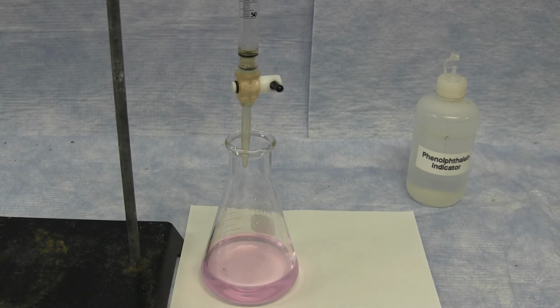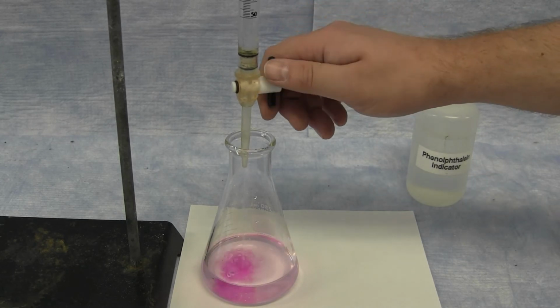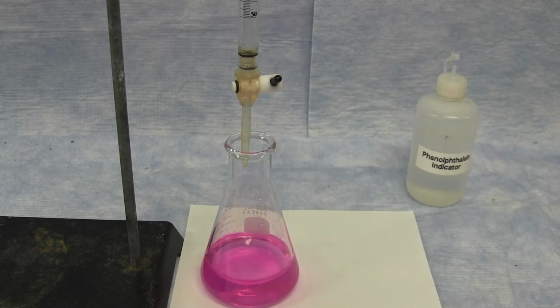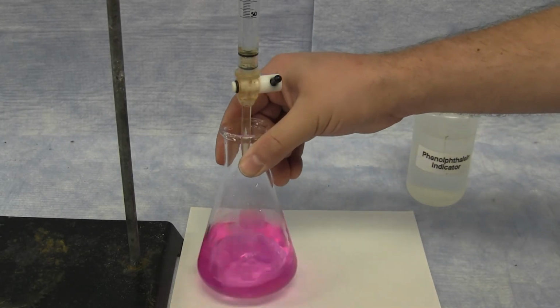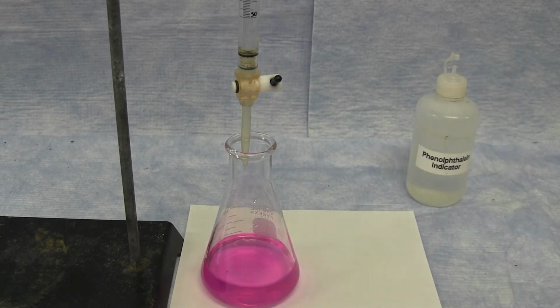If you over titrate, and that is you add more base than this exact equivalence point, the solution color will become very, very dark. This very, very dark color would be an indication of an over titration and will skew your results. If in your 4 trials you have one obviously over titrated sample, you can perform a 5th titration to make sure that your final equivalent weight is accurate.